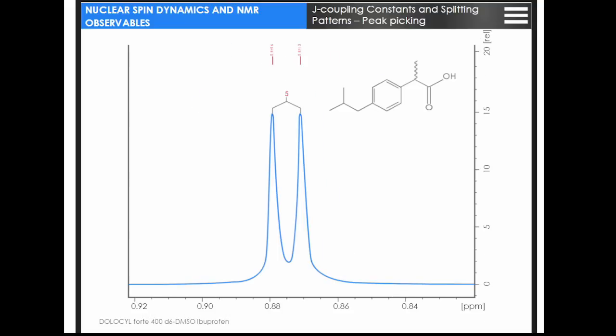At the next step, picked peaks are semi-automatically grouped into multiplets for further analysis. The strongest resonance, which was assigned in the integration step to two methyl moieties in the isopropyl group, is identified as a doublet. The doublet splitting pattern appears if a spin or group of spins, as in this case, is J-coupled to a single spin 1/2. This spin, causing the doublet splitting of the protons from the two methyl groups, is indeed present in the structure and highlighted in the green circle.